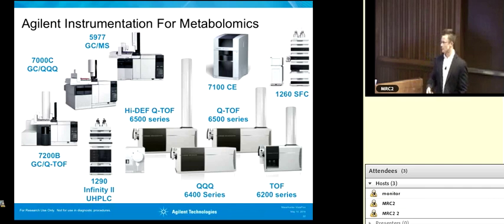It'll help if I actually point at the right one. We're seeing one 5-carbon labeled building block here and another one, and we can see as this trickles through. At 3 hours, the first M+5 was the highest abundance, and at 8 hours it was down because it had already made a second incorporation. And again, the node fill up here, based on the intensity of the color, lets you know how intense the metabolite pool is.